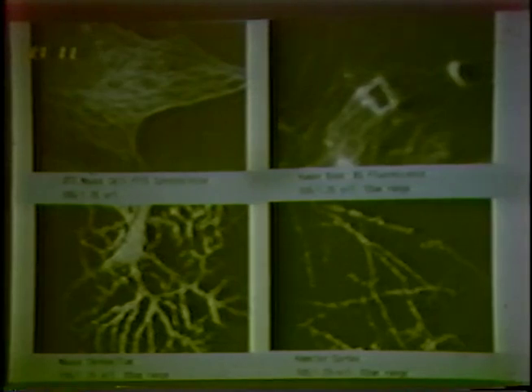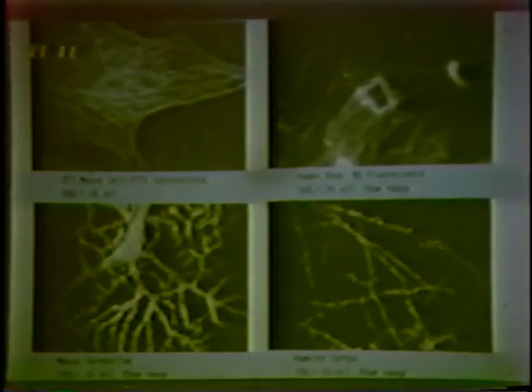And that, as I shall hope to remember to explain later, is the way by which you can extend the focus range of this kind of microscope, yet maintain the full resolution and clarity, because you are only adding together a series of images of image planes which are really perfectly in focus.